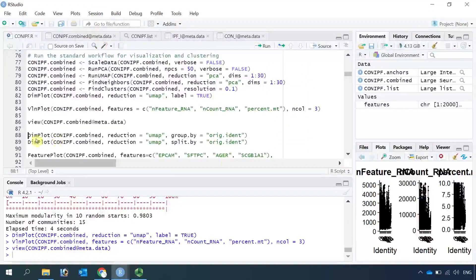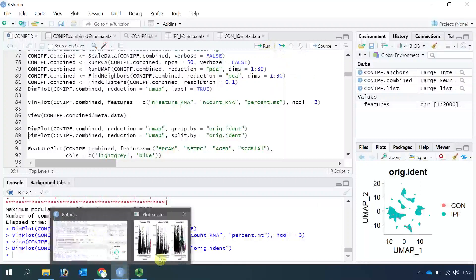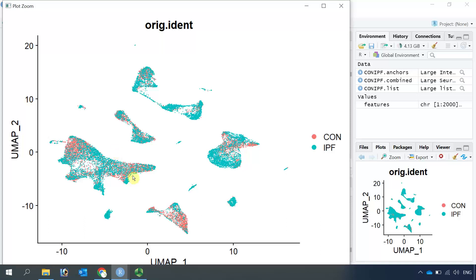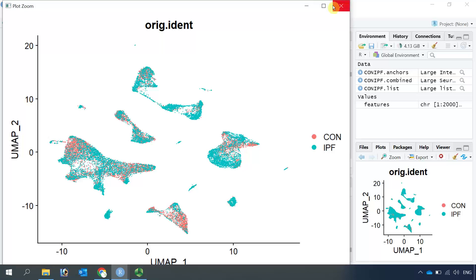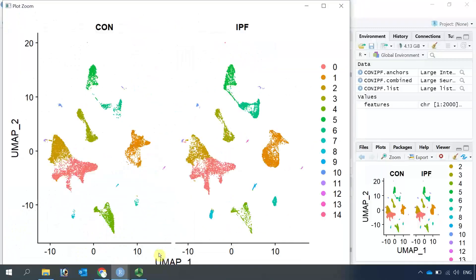Now we can add more parameters to the DimPlot — for example, we can group the cell clusters by origin ID. You can see all the cells are well integrated between control and IPF lung datasets. We can also use the split.by function to see control and IPF cell clusters side by side. On the left-hand side are cell clusters from control samples, and on the right-hand side are cell clusters from IPF lung samples.